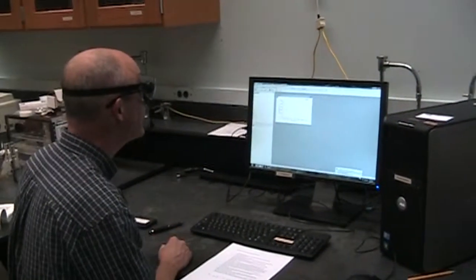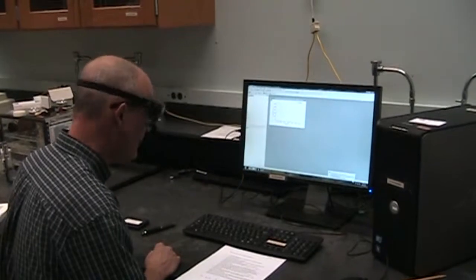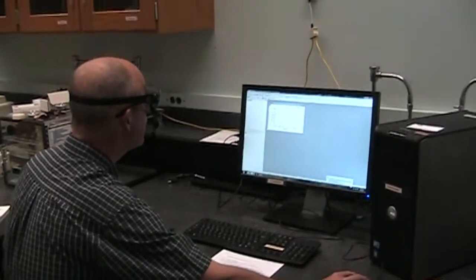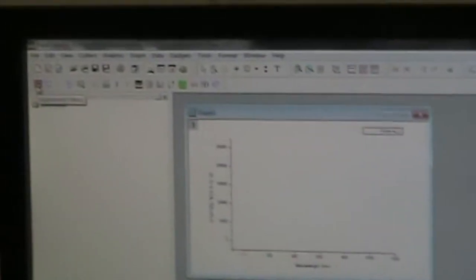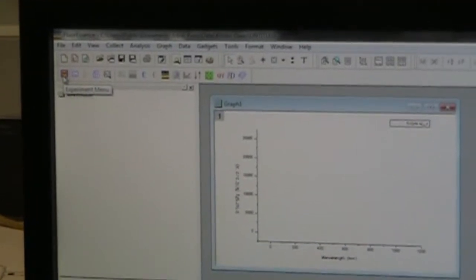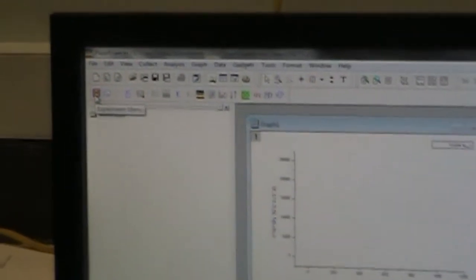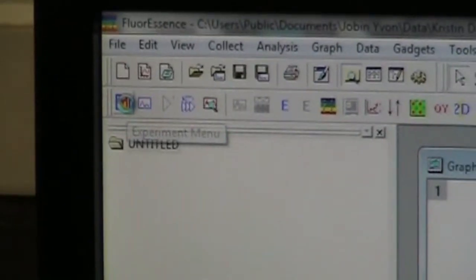To get to the place in the software where we want to be to make the measurements, we've got two rows of icons. We're going to use the second row of icons. All the way through the left there's an M. And if you hover over it, it says Experiment Menu, so I'm going to click on that.